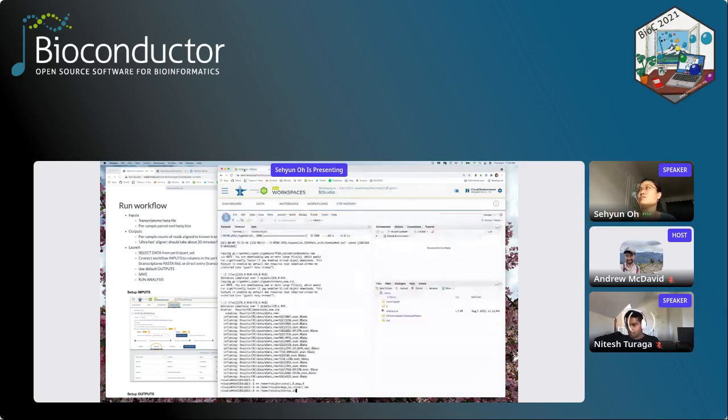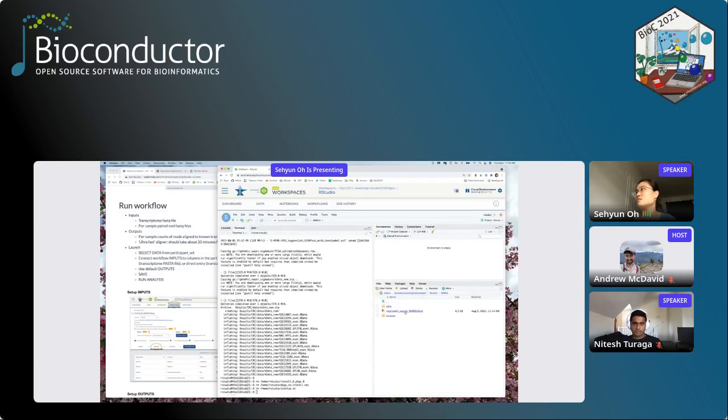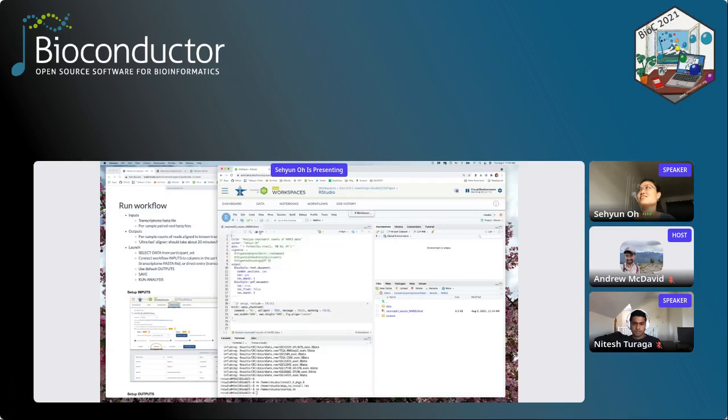And let's see what happened to the RStudio session. Oh, okay. So earlier I did RStudio, and then setup. I tried to run that setup script, startup script, and now it's set. So I go to Genomics super signature paper, and everything is there. Some of the large data files are already there. So let's try something like, let's do NARS data. So I go to the RMD file, and then just knit.